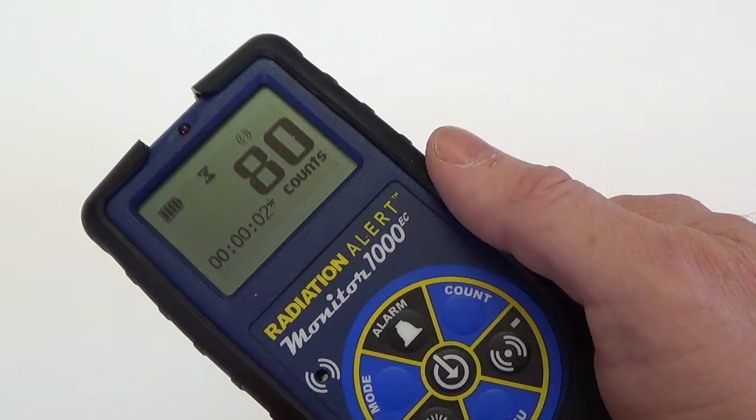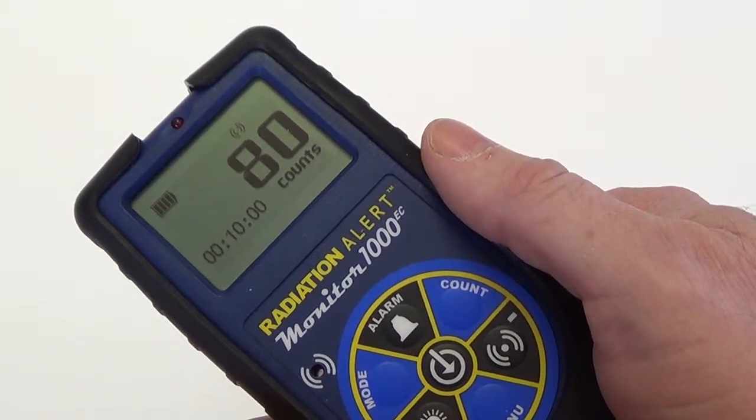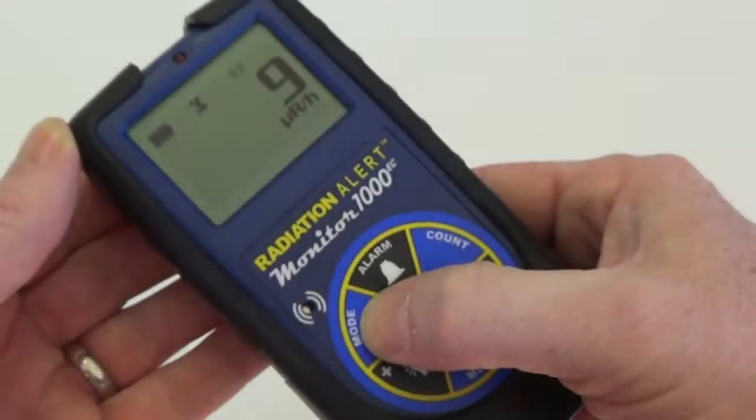Two beeps will indicate that the count has completed. The preset count time is displayed on the lower left. If you're in another mode, the hourglass icon will remain solid until you switch back to the count screen.